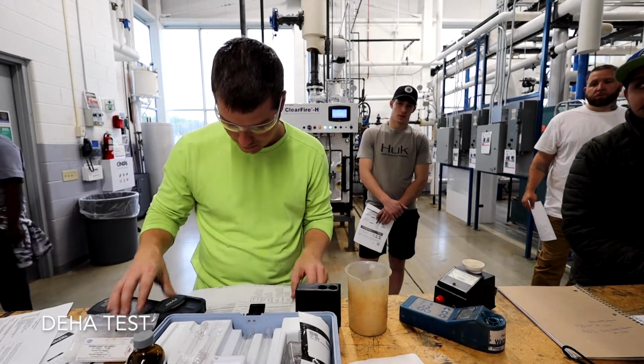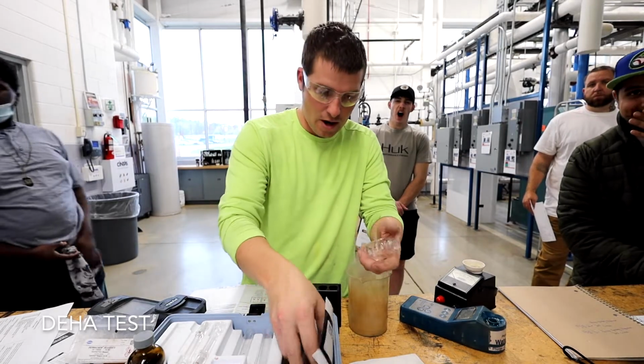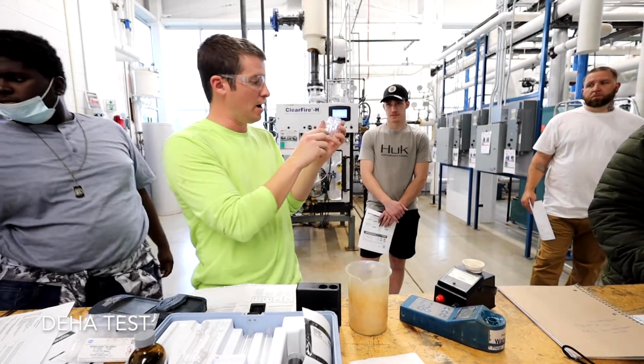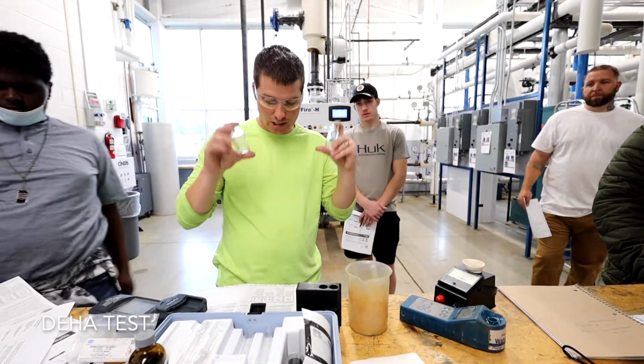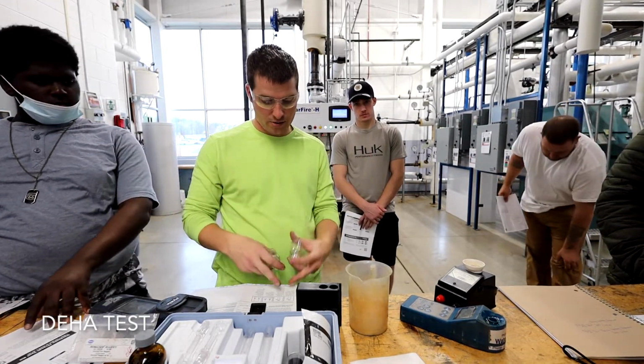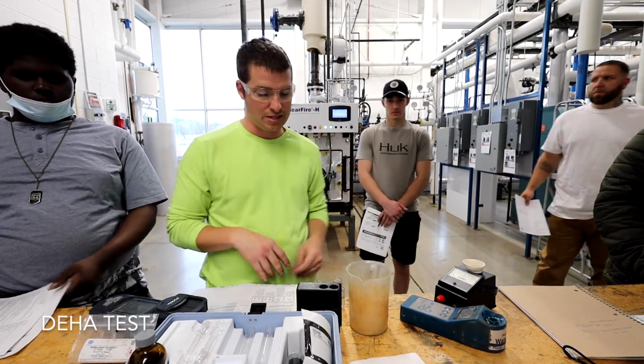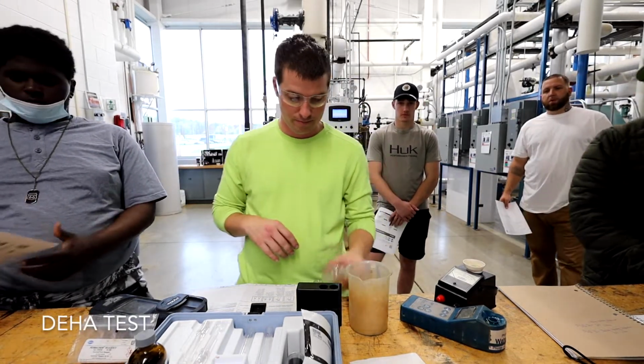So now we're going to grab out our little vials. I've already marked them. If you have glass ones like this, let's say you had this kit, I always mark one with a B and one with an S. It tells you to do that so you know one's your blank and one's your sample, because you're going to add different things into them based upon whether it's your sample or your blank.